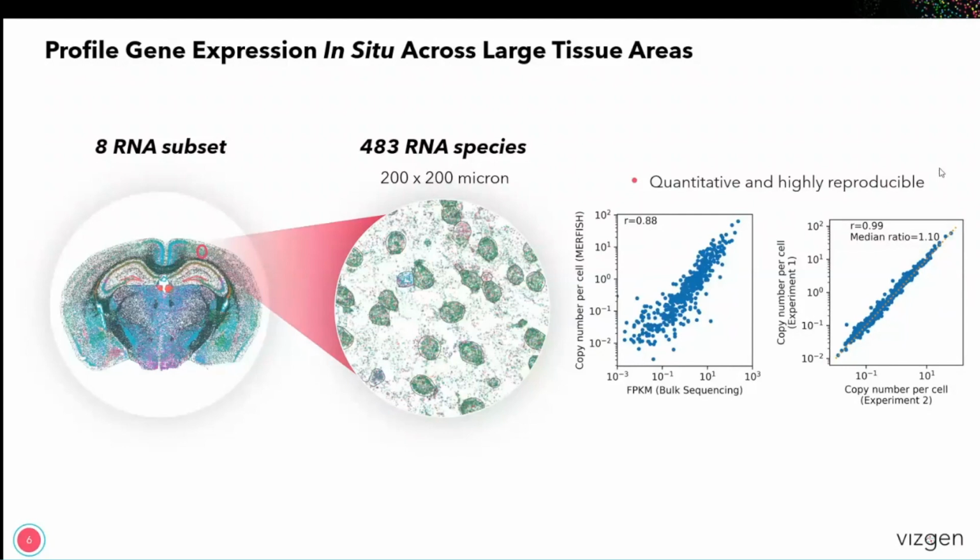This is important as once we assign those transcripts into those cells, we can then identify them and then map those cells back to the entire tissue section and get an idea of where those cells exist on a tissue level scale, and which cells they're next to and which cells they're interacting with.